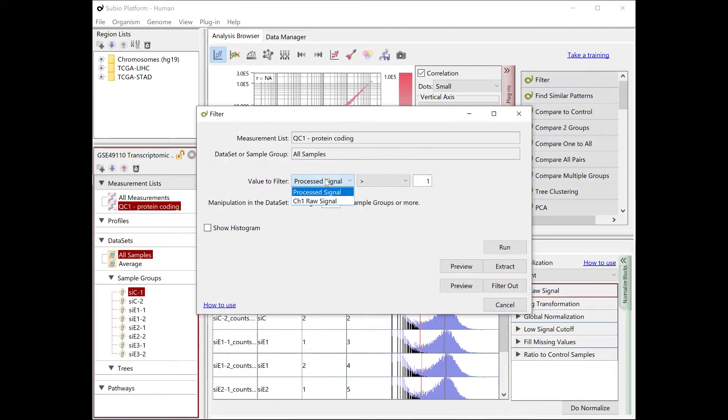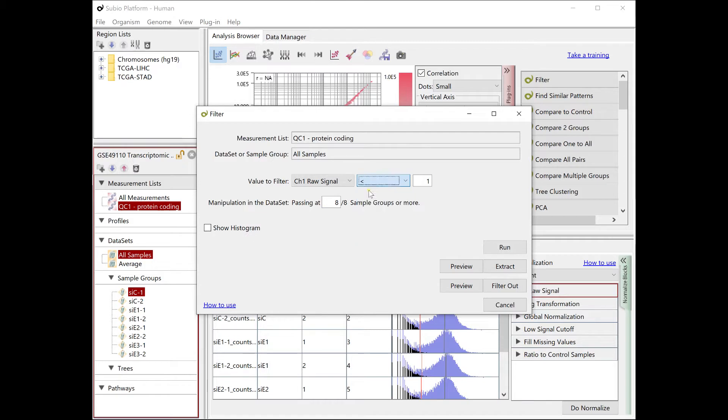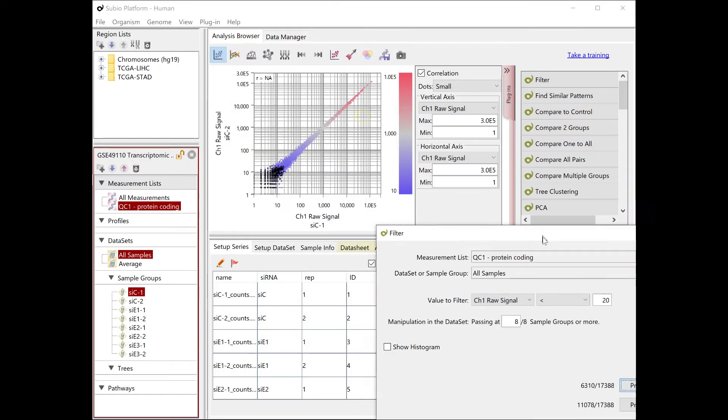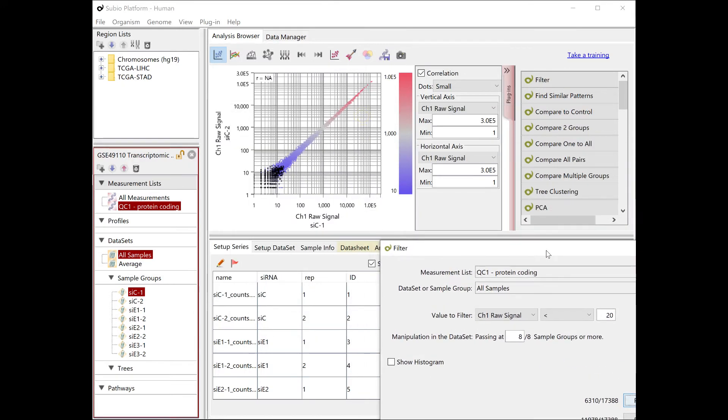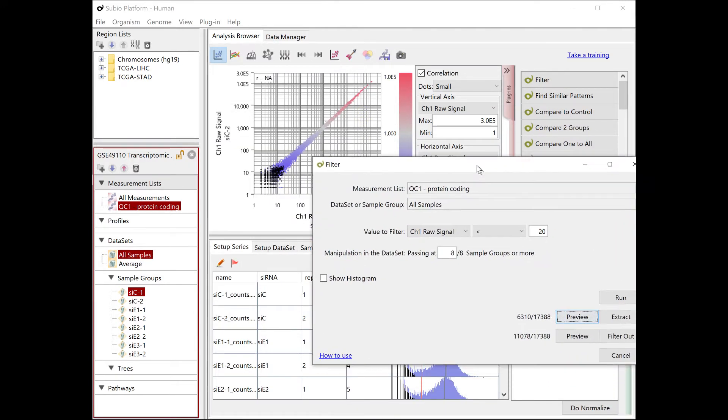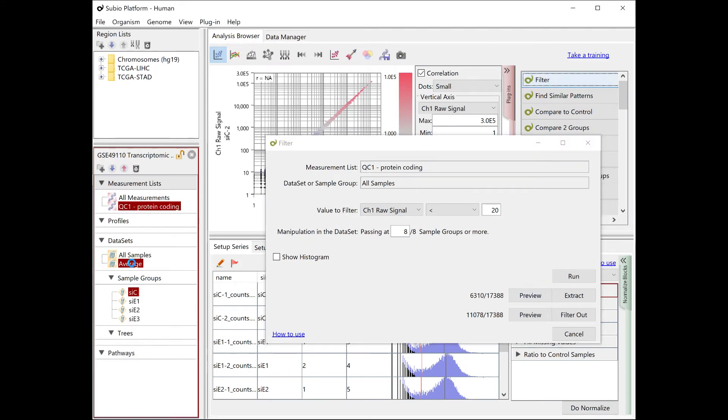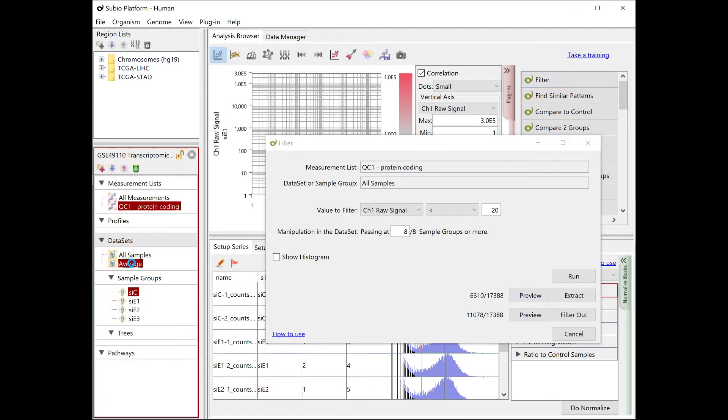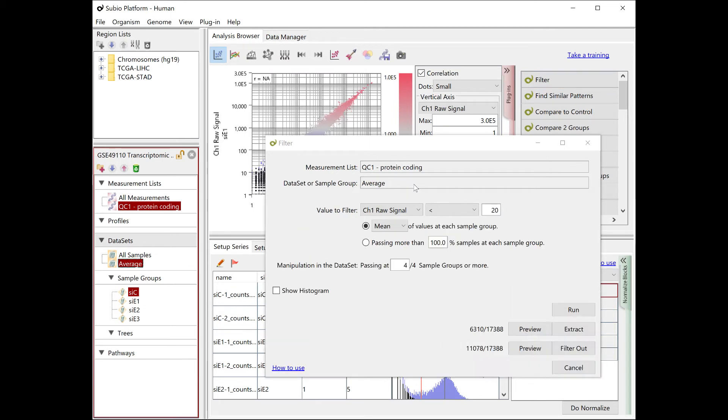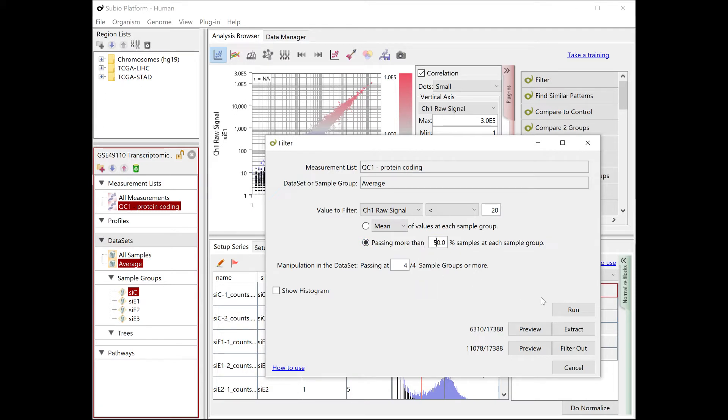For example, a gene with less than 20 counts in all 8 samples can't be properly analyzed. The 8 samples are duplicated samples of 4 groups. If counts are less than 20 in one of the replicated samples in all 4 groups, there should not be any valid averages. We collect more invalid genes than the way we did earlier.